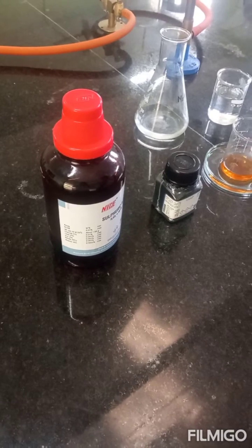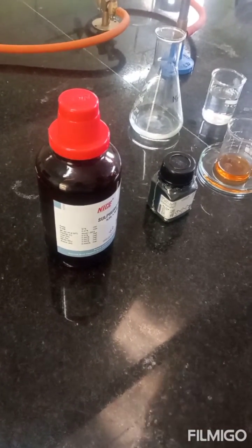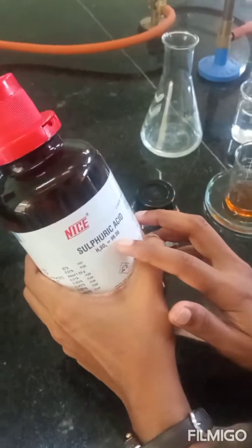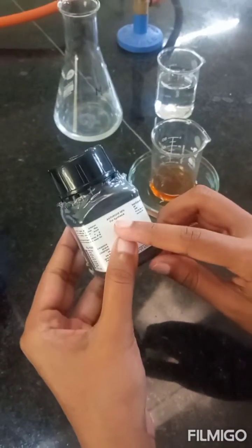This is an Antheron test for detection of carbohydrates in a given test solution. The Antheron test is a general test for all carbohydrates. The reagents used are concentrated H2SO4 and Antheron reagent. Antheron is an aromatic ketone.